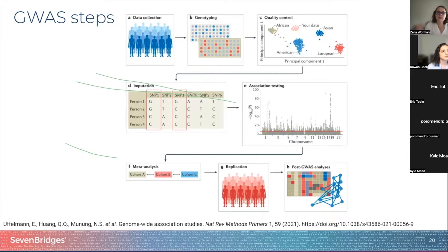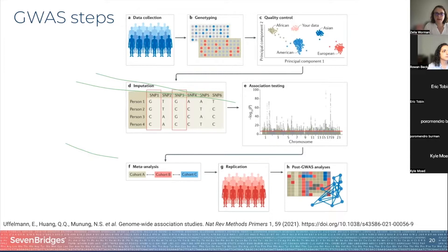The next step is to run the genetic association tests for each genetic variant using an appropriate model. Each genetic variant is going to be tested for potential association with the disease. We will use today a single variant association testing model, correct for population stratification and multiple testing, and generate a Manhattan plot output.